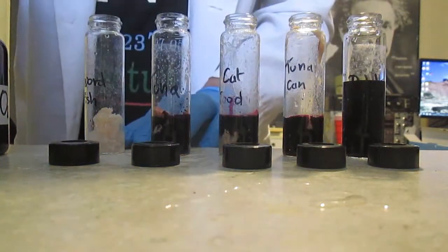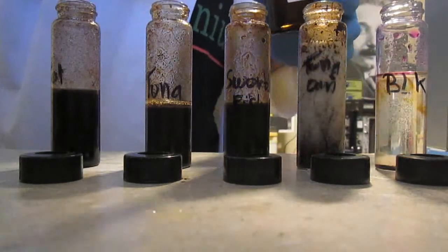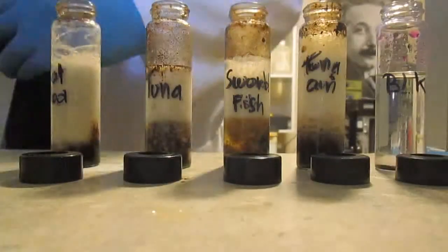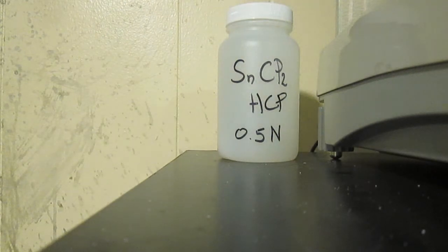The sample is then digested at 95 degrees for 2 hours, and when cool I add 1.5 ml of 12% hydroxylamine hydrochloride to clean up the permanganate. Finally, 1 ml of stannous chloride at 0.5 normal is added to reduce mercury to its metallic form.